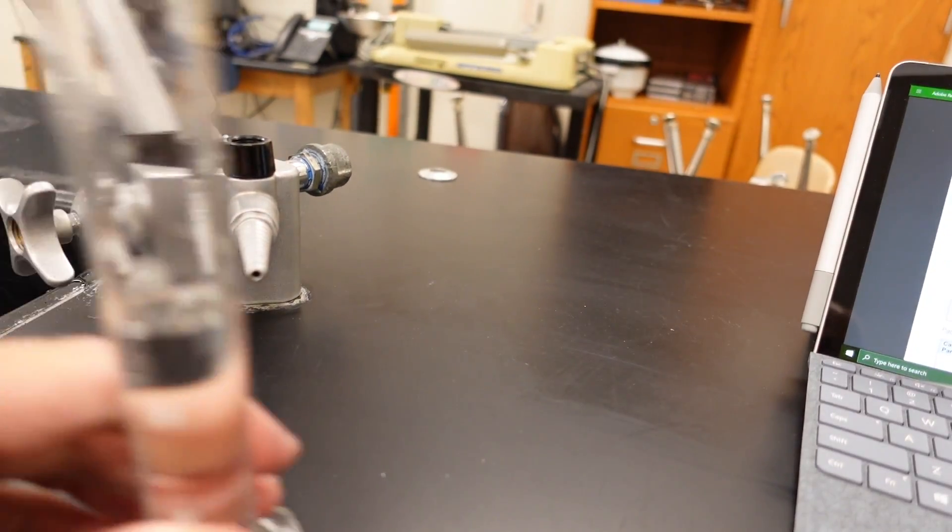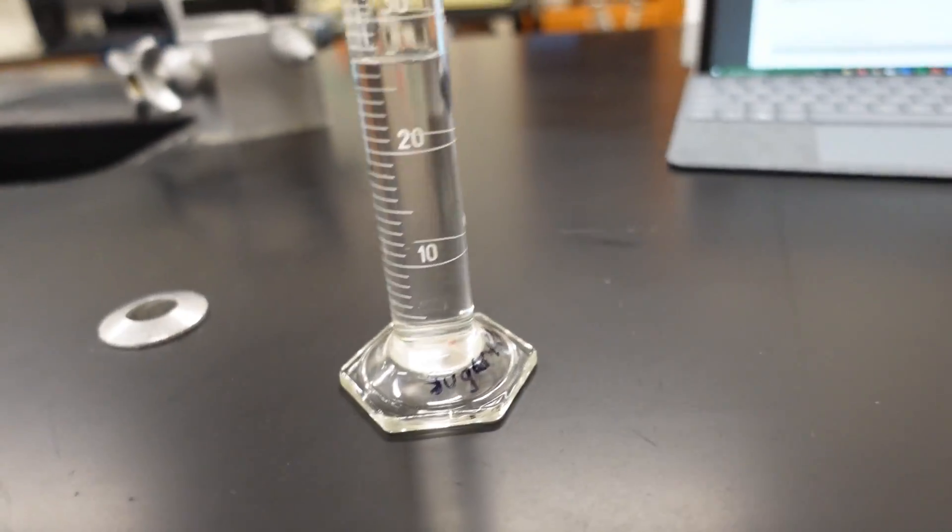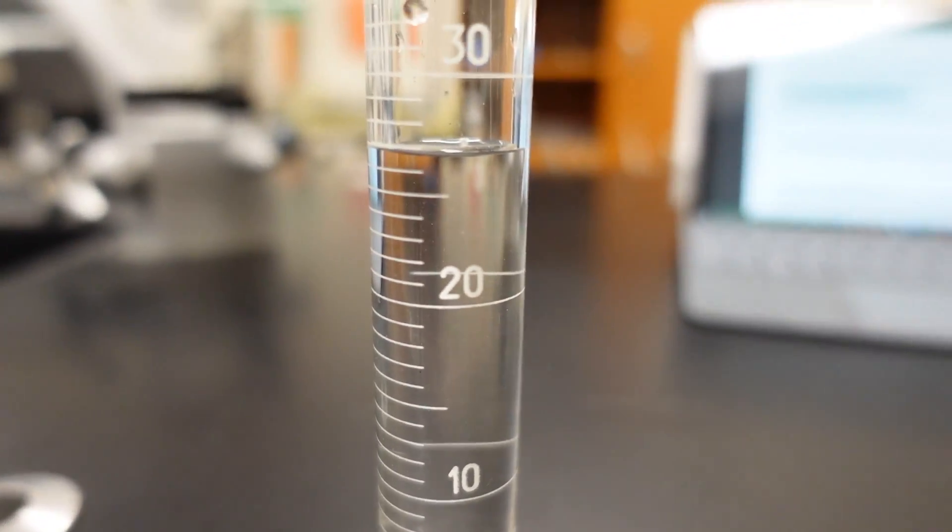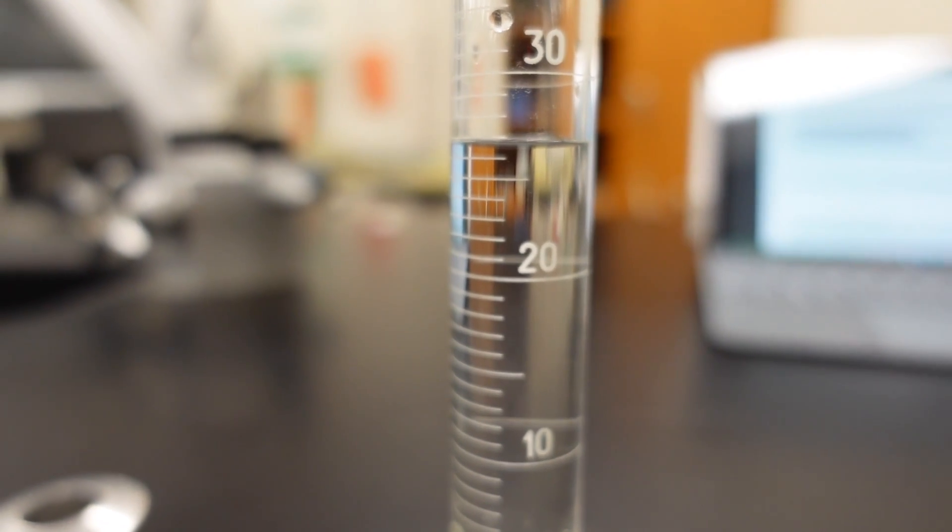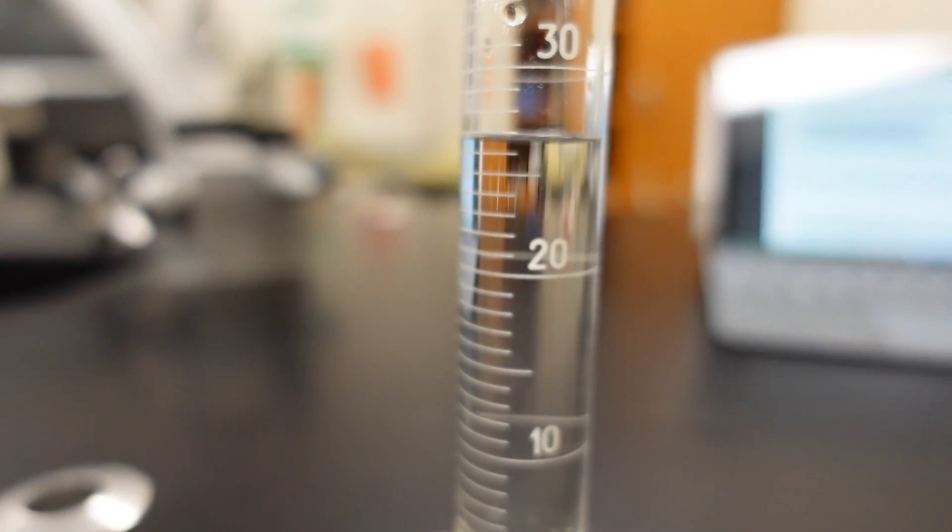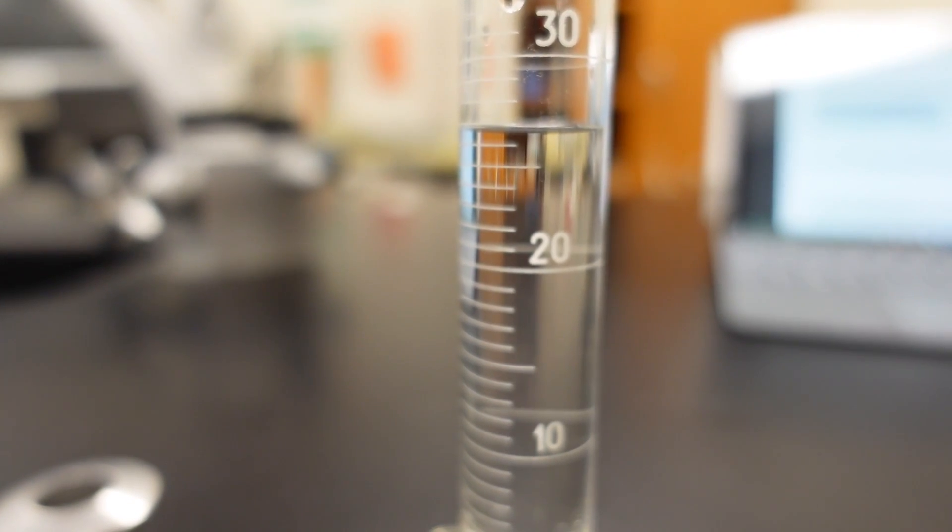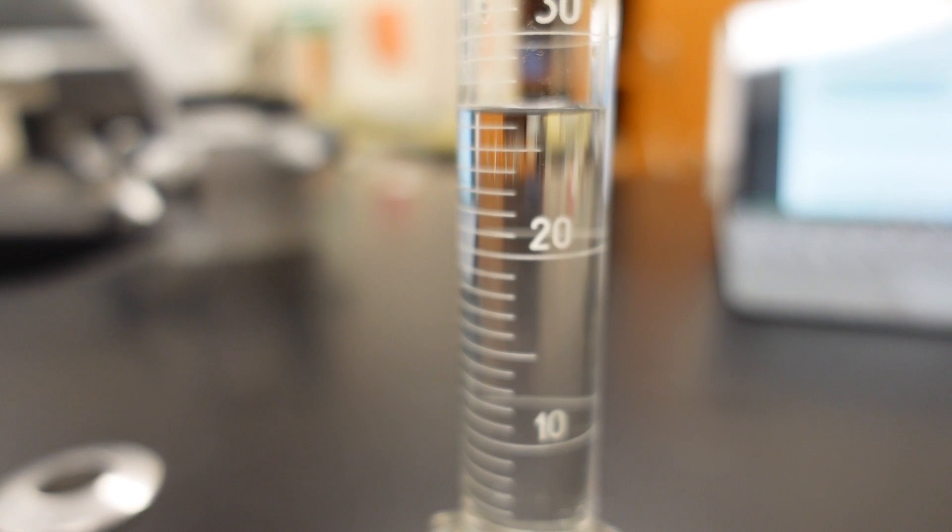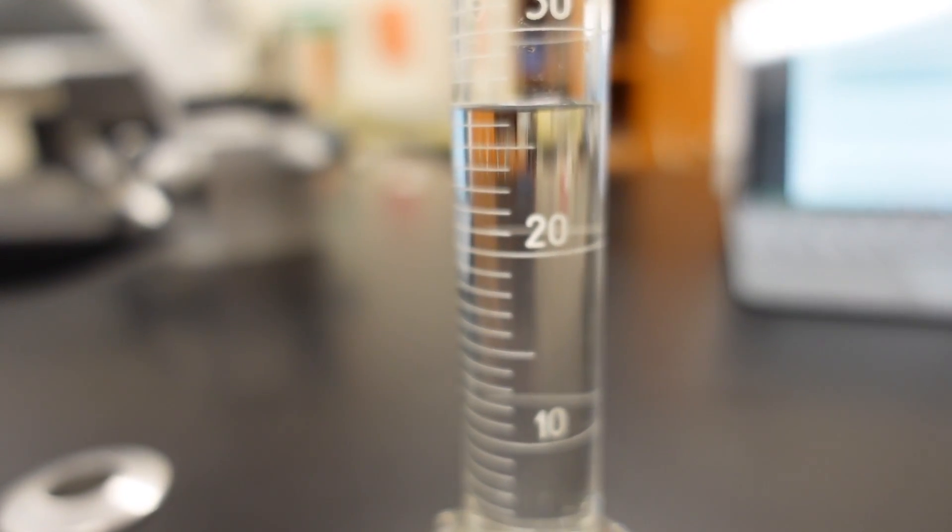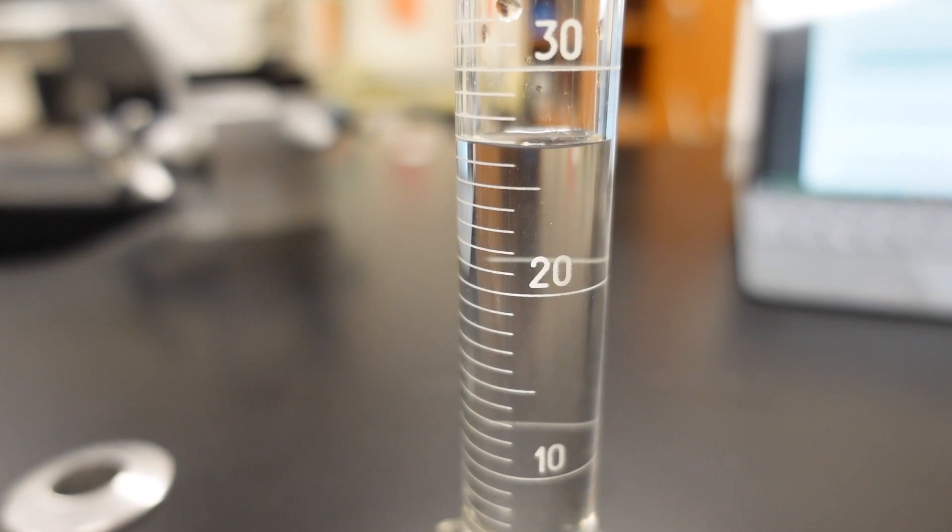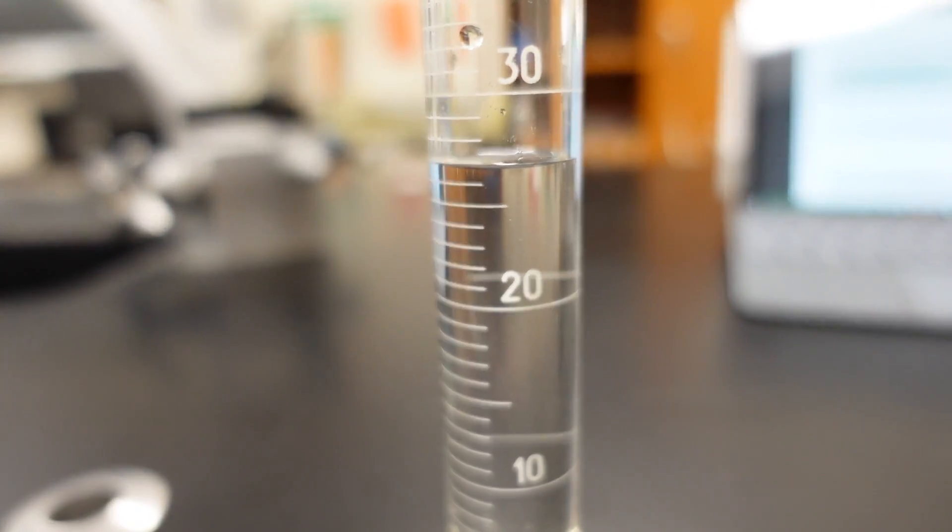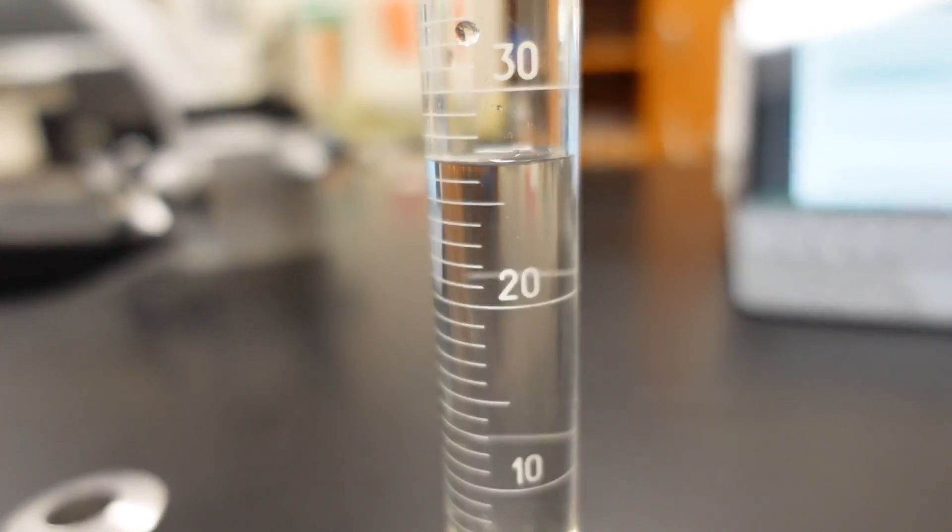Let's get you level with it. You always want to read from the bottom of the meniscus, the lowest point. Okay.